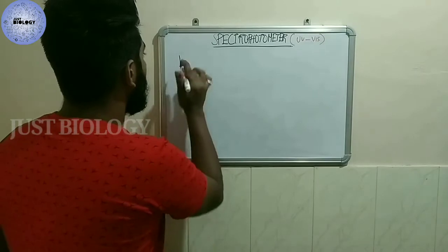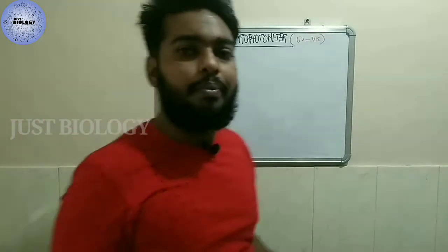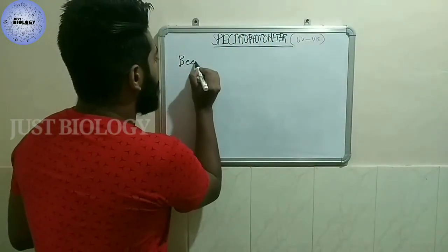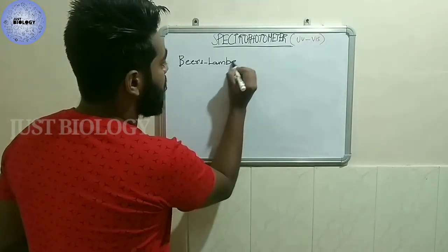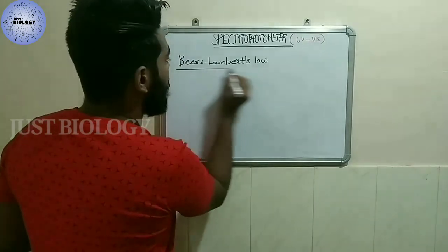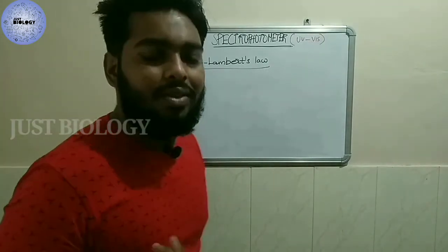That is the first one we want to discuss when we speak about the principle of the spectrophotometer. Actually, what does Beer-Lambert's law state?